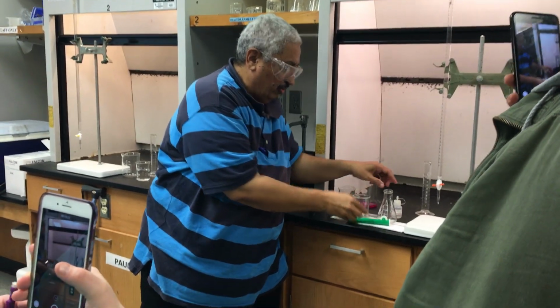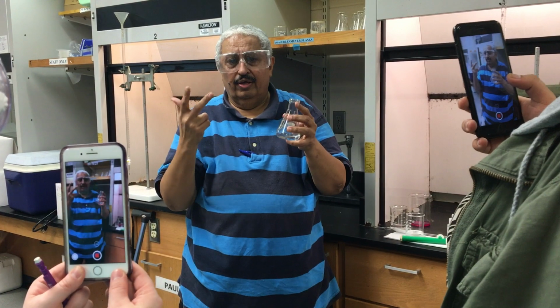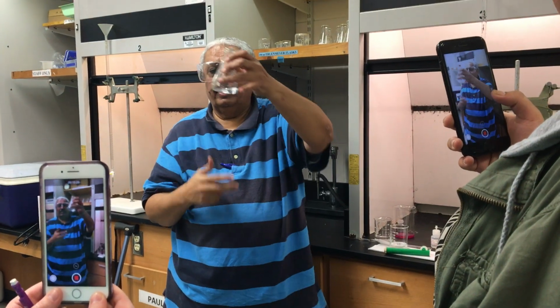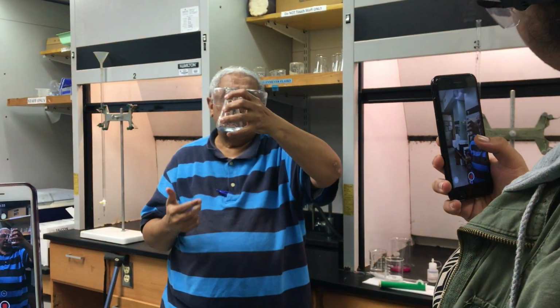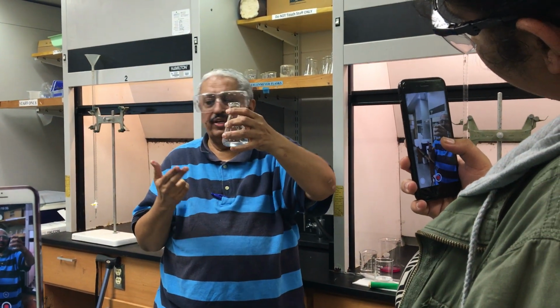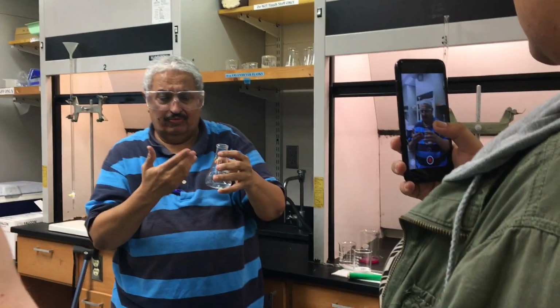Now we have how many components? We have 3 components here. 3 drops of the indicator, colorless. See here, no color. If it's a base, it will give me pink, so no color. And then I have 2 mL of acetic acid, and then 10 mL of H2O. Now, if you get more than 10 mL of H2O, it does not really matter, it's just for the color.